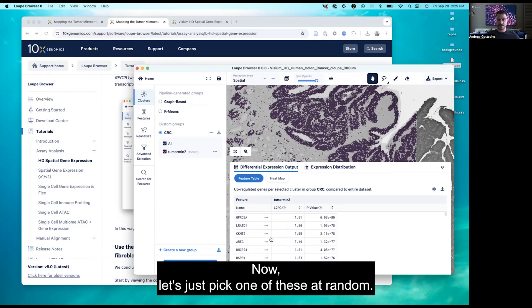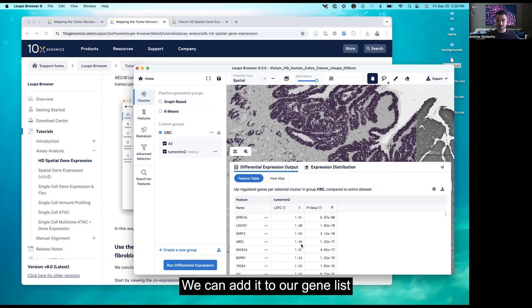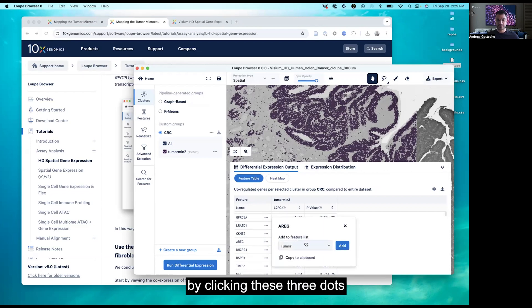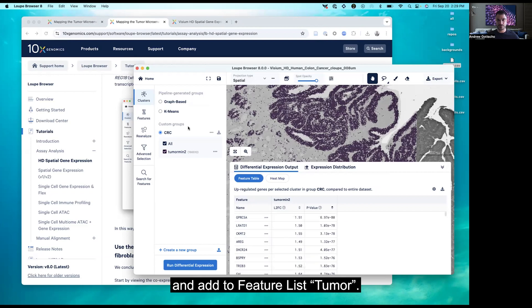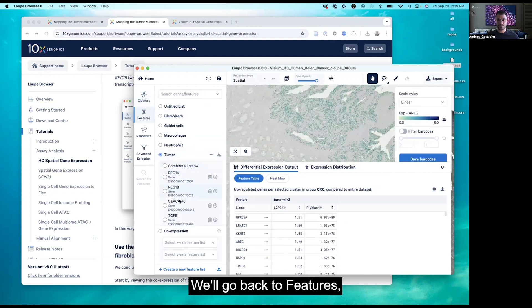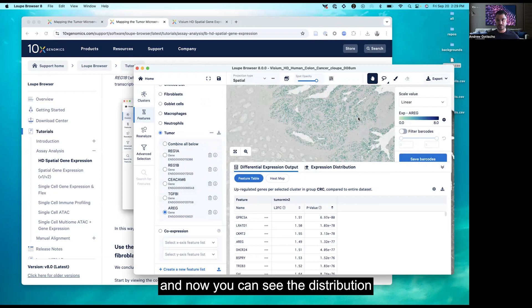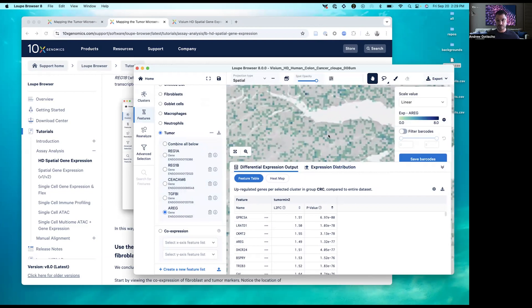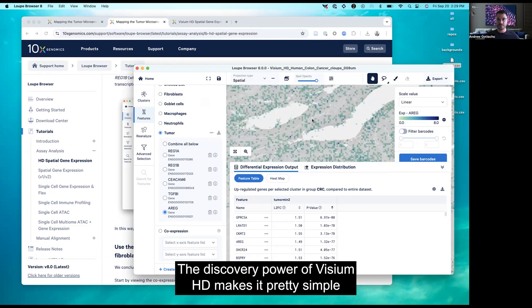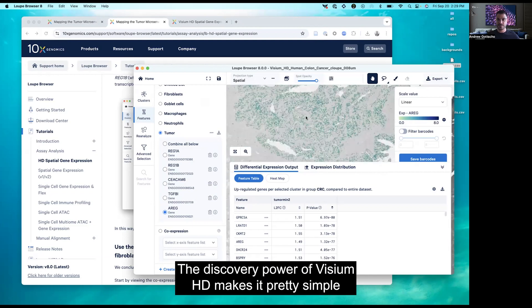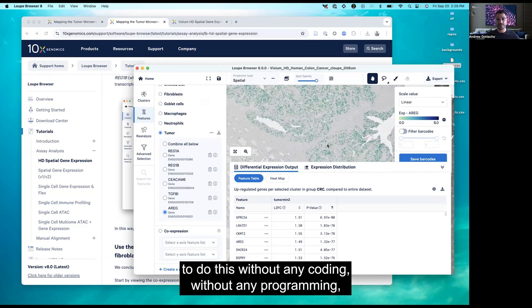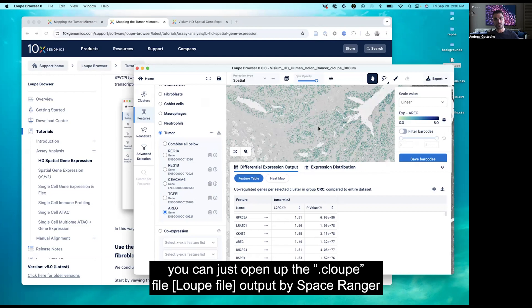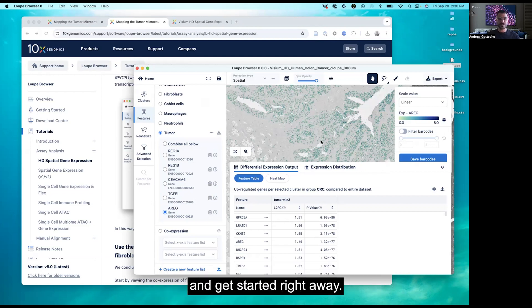Let's pick one of these genes at random. We can add it to our gene list by clicking the three dots and selecting 'Add to Featureless Tumor.' Go back to Features and now you can see the distribution of this gene at quite high resolution. The discovery power of Visium HD makes it simple to do this without any coding or programming — just open the CLR loop file output by Space Ranger and get started right away.